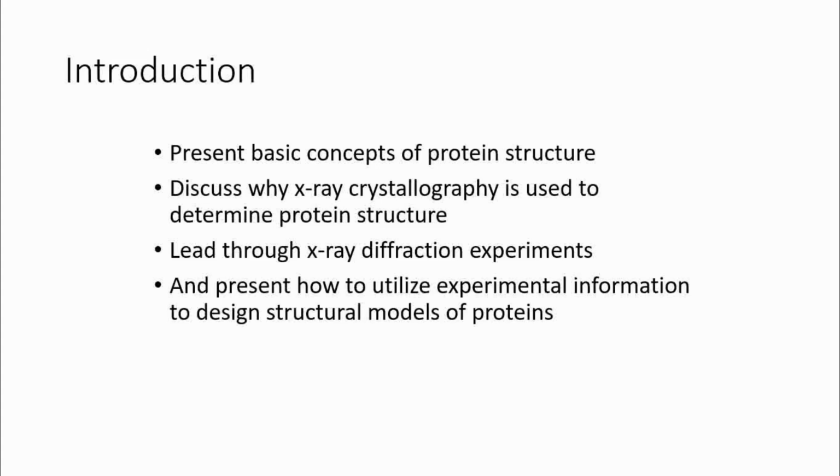So crystallography is a technique which, grossly speaking, is used to understand the structure of a protein. Why am I talking specifically of proteins here? Because you can have a lot of structural orientations of proteins. You can have different types of proteins. Your proteins can bind with other ligands also, making it a very complex structure to elucidate, and we will be taking it step by step forward.